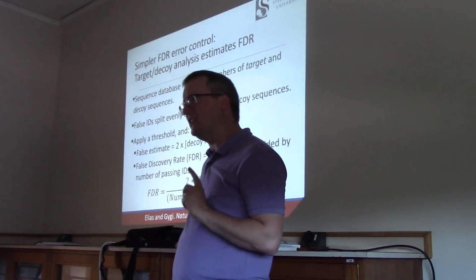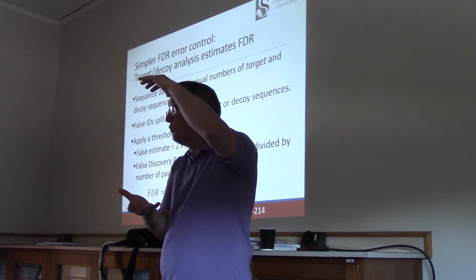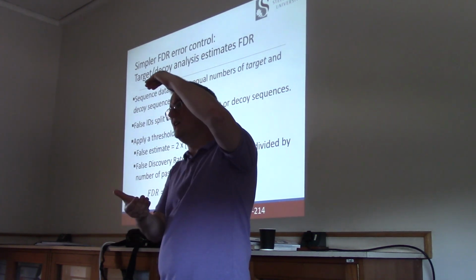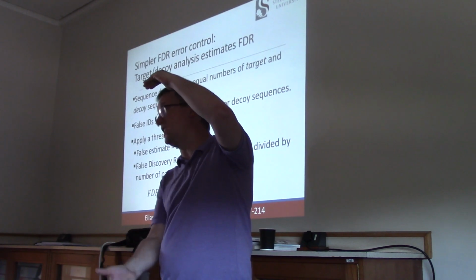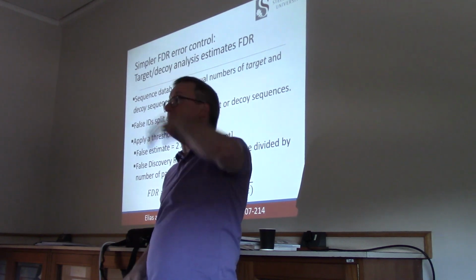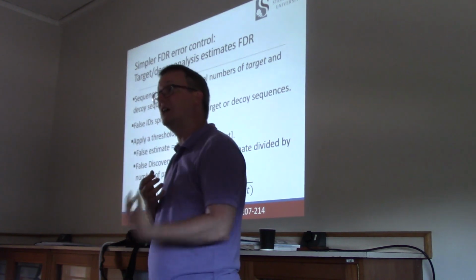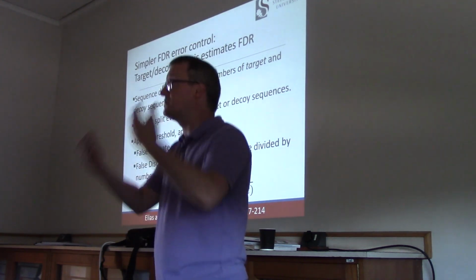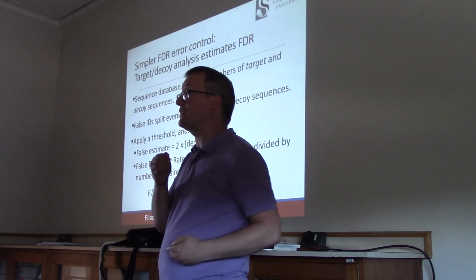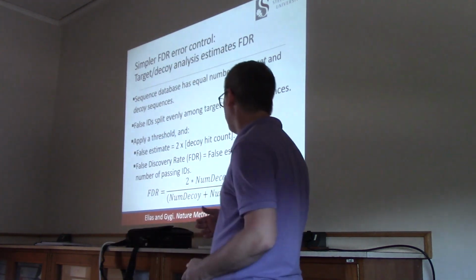Now, something that we frequently don't talk about in proteomics is that some of the spectra outside this range were also correctly identified. But because accepting them requires us to accept too many decoys, we deem them as lost. So we may have a much larger number of spectra that were correctly identified that fall outside this set, but the cost of accepting them is to produce too high an overall discovery rate. Those are false negatives. Those spectra have been deemed to be falsely identified even though they are real. So that's an uncomfortable place.